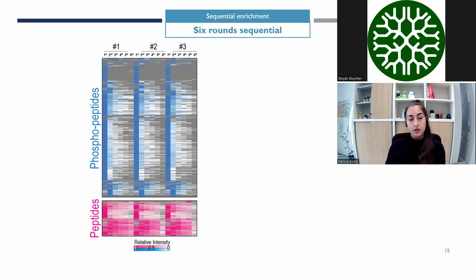However, although it is nice to get more phosphopeptide identifications by such a sequential enrichment, one has to keep in mind that sequential enrichment does not only involve more sample preparation time and subsequent MS measurement time, but there is also no standardized approach on how to handle multiple enrichments from a quantitative perspective, when we consider that we have a high redundancy of phosphopeptides that were identified across all these sequentially enriched fractions.